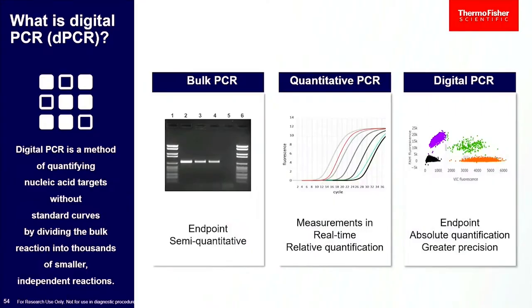So we talked about gels. That was PCR with endpoint quantification. That's where we started. We just spent a lot of time talking about real time. Real time is where we can quantify what's going on. Digital is where we pick up on the sensitivity of qPCR. So if we're not getting the data we need, we have too little sample, or our differences are too small, that is a great time to move to digital.